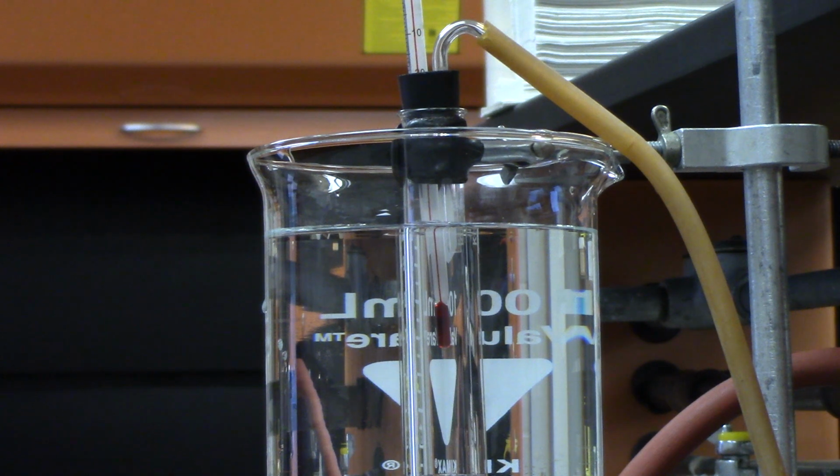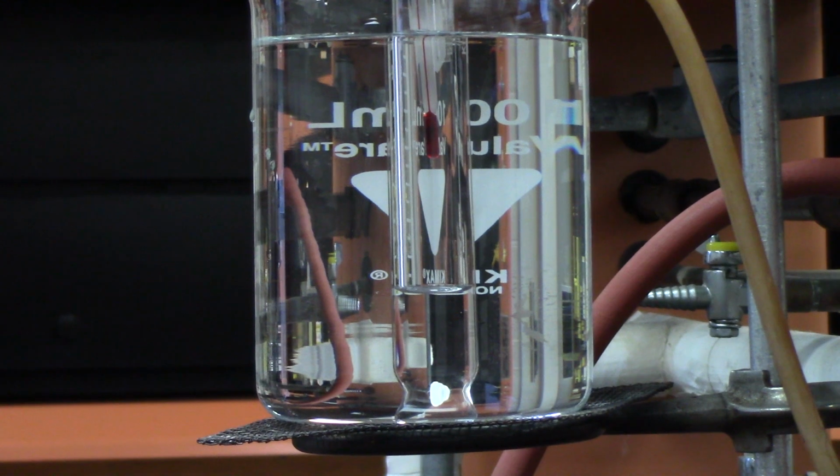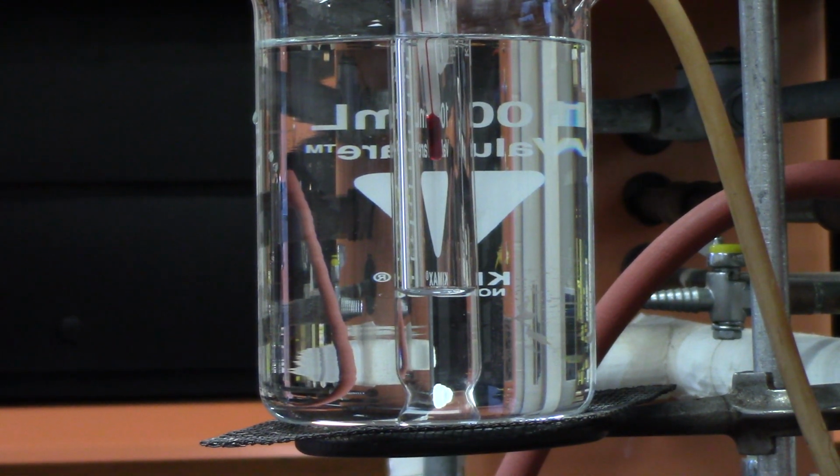The water is going to transfer its heat energy to the unknown liquid, and it's going to heat up as well. And so what's going to happen is the temperature of the unknown is going to go up, and as it goes up, obviously the thermometer rises.